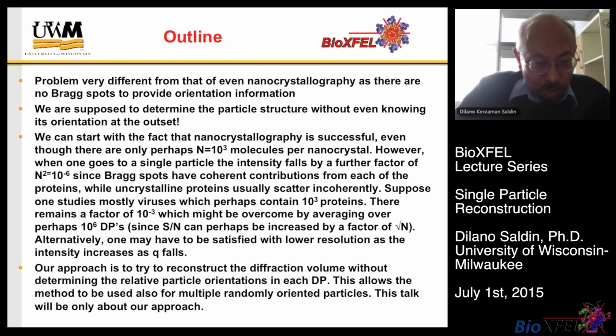So the particular approach that I will try to talk about today is to reconstruct the diffraction volume without even determining the relative particle orientations corresponding to each particular diffraction pattern. This allows the method to be used also for multiple randomly oriented particles. And this talk will only be about our approach.